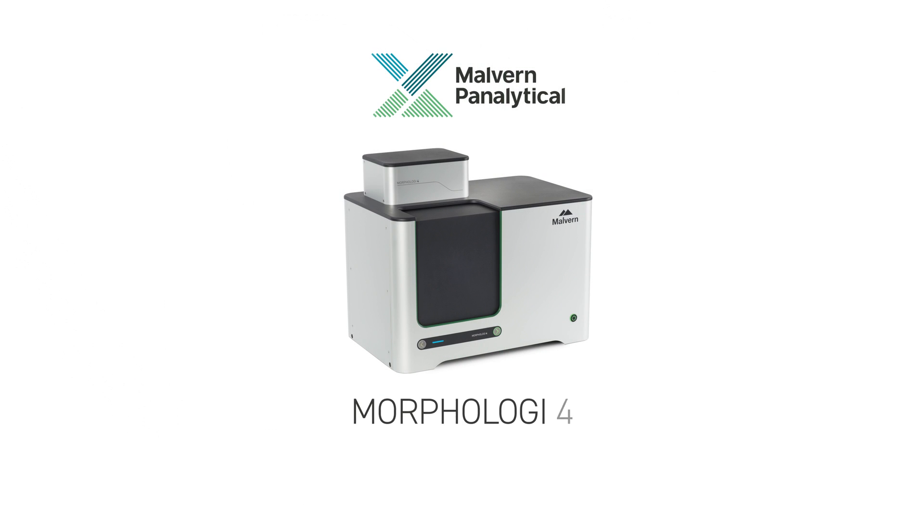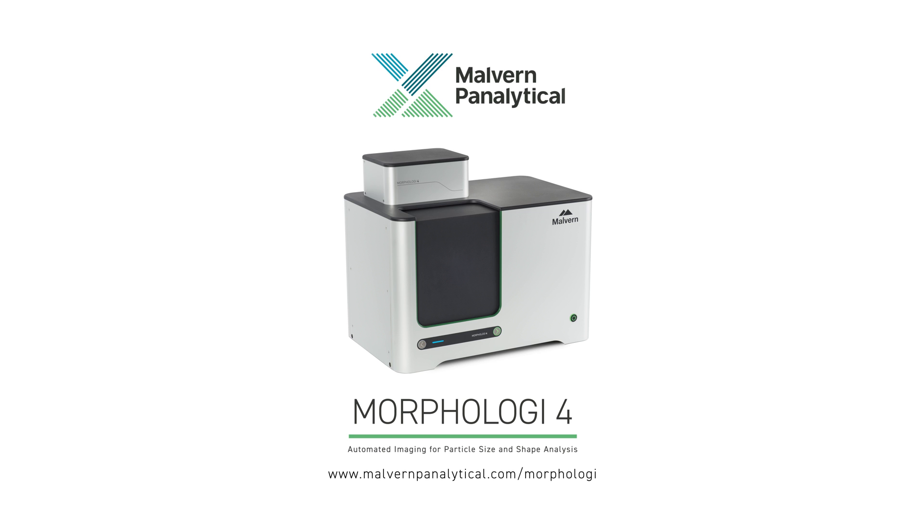For further information on the Morphology 4, visit us at www.MalvernPanalytical.com.